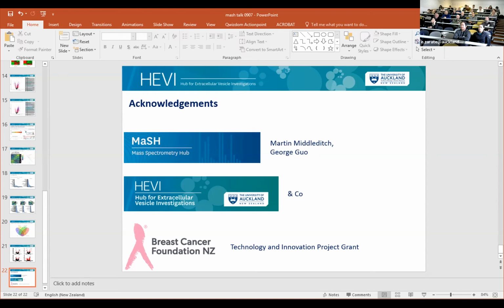In terms of the bilberry fruit, you can see it's very high early on in the skin, and then it kind of drops down over development as it gets more mature. This is kind of characteristic of a compound which has been produced to defend the plant or to screen out the UV.